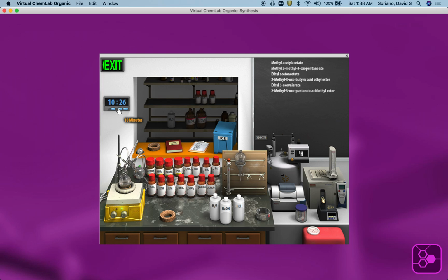But let's go up 10 minutes. 177. 3 products. Four products. We're at 177 Celsius, and we have 4 products. And we expect 4.